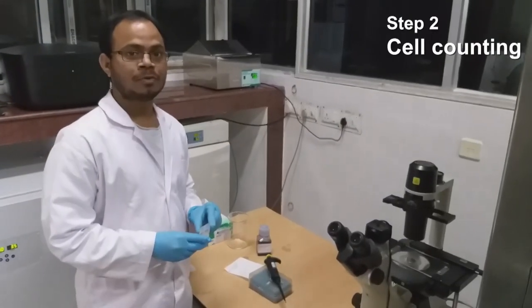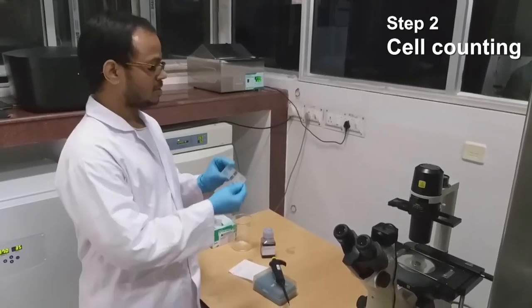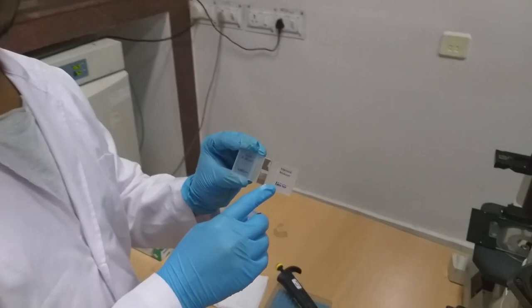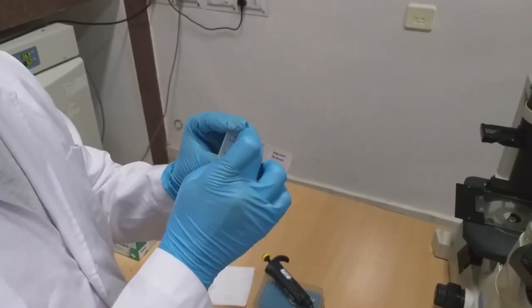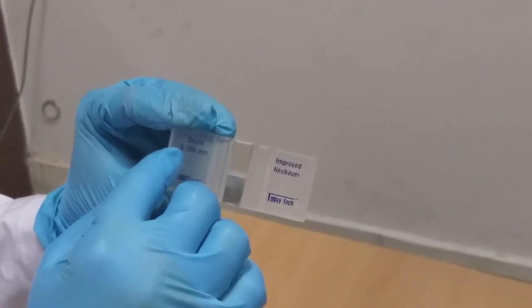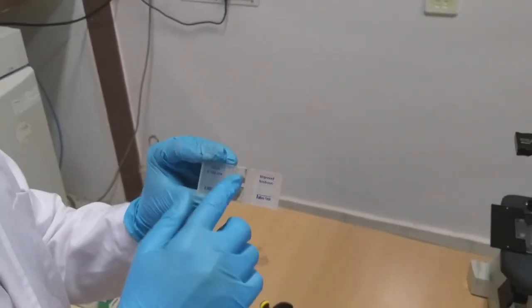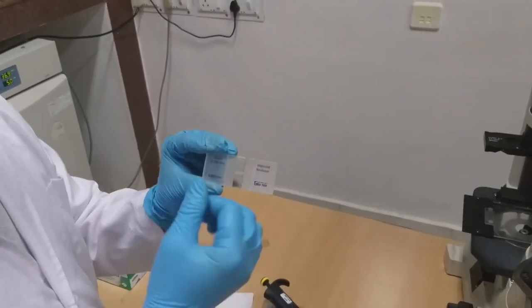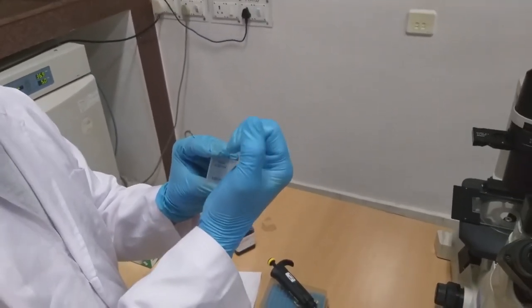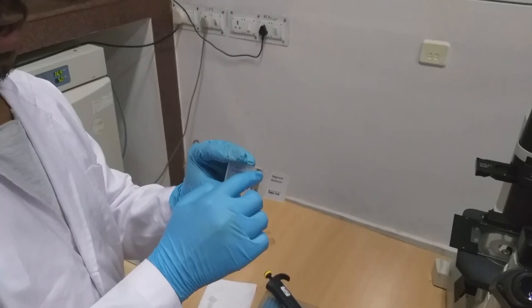Before counting, we have to see how a counting chamber or hemocytometer looks like. This is a typical hemocytometer, also called Neubauer chamber, which contains these squares on the upper side and lower side, with each square having a depth of 0.1 mm and area of 0.0025 millimeter square. Now I am going to put a cover slip on this chamber, then I will add the cell suspension slowly. Through capillary action, it will spread all over the squares.